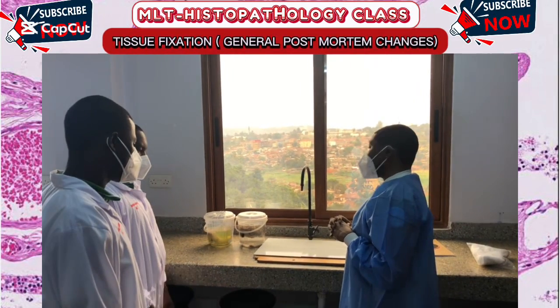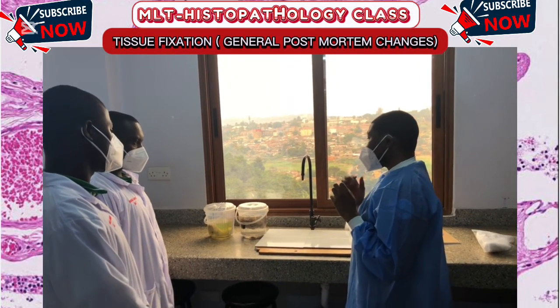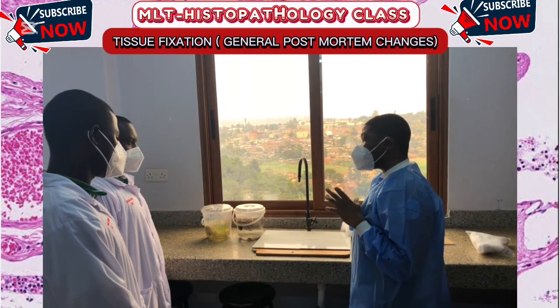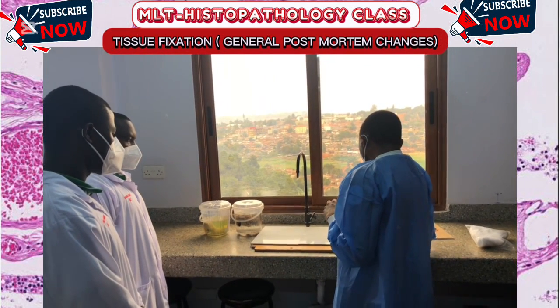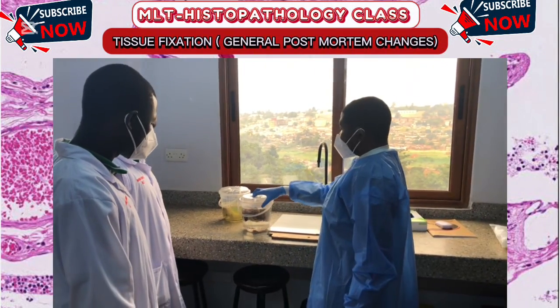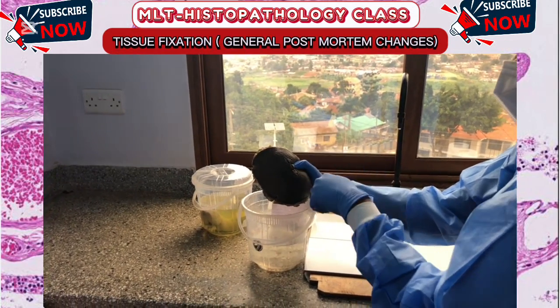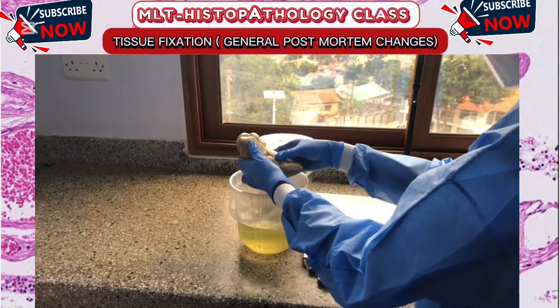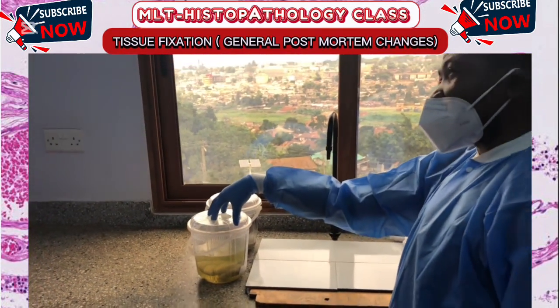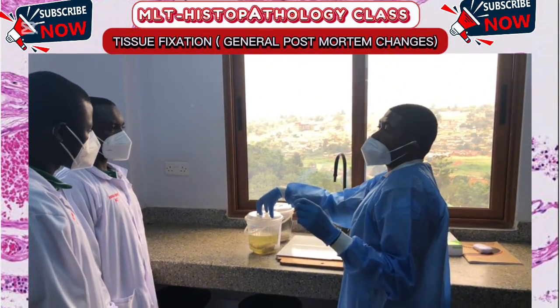Tissue fixation. We are looking at histology samples, and the major aim is to maintain the tissue in a lifelike state. So in front of us we have two histological samples. One of our samples is breast, in regard to tissue fixation. Number two, the kidney. Fixation is the process of preserving biological tissues in a lifelike state.